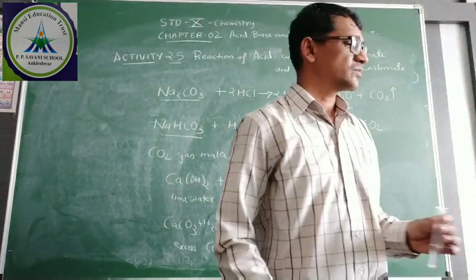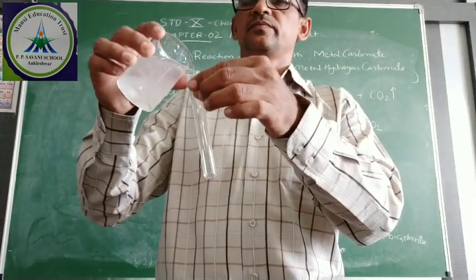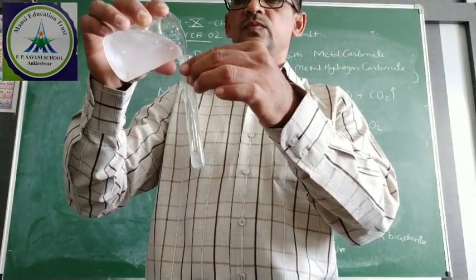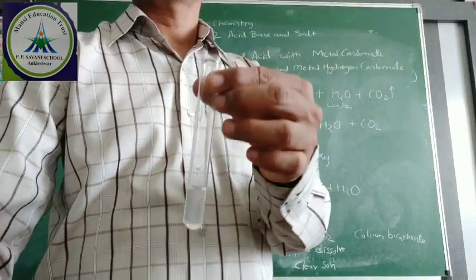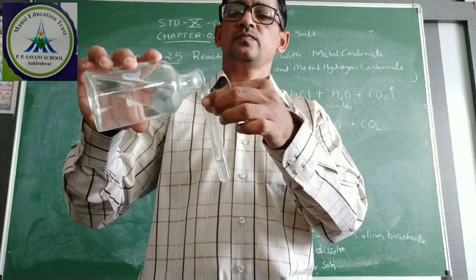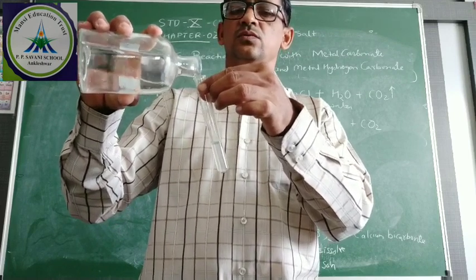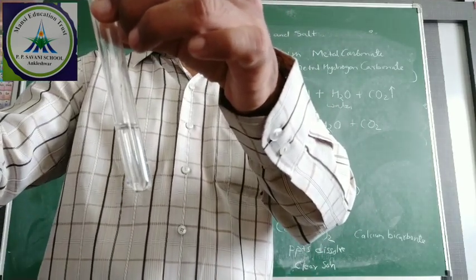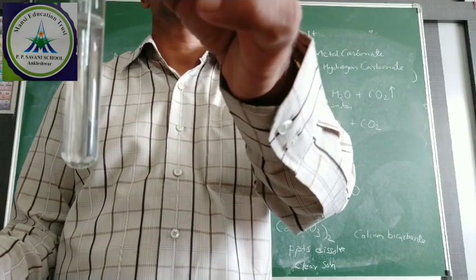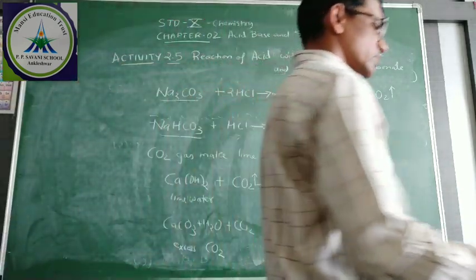Similarly, I am taking this bicarbonate. In bicarbonate, I add HCl. Again it gives effervescence, and CO2 gas is produced.